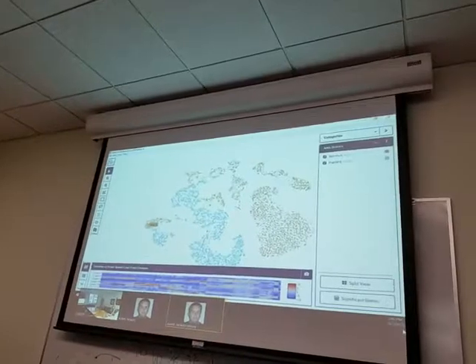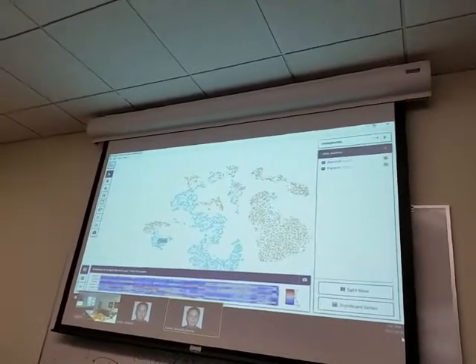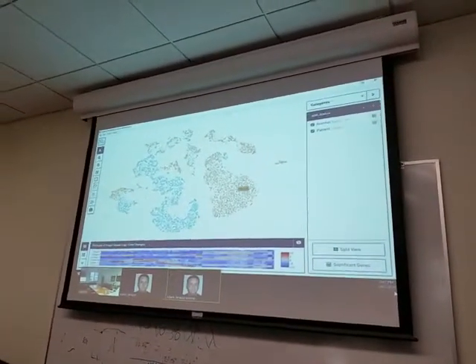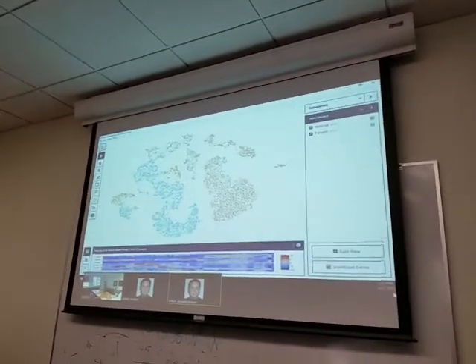You have still successfully identified what these are, and actually, in my opinion, at a higher confidence level because these are different cells from this. All right. Everybody in the room is saying, I don't know what I'm talking about.